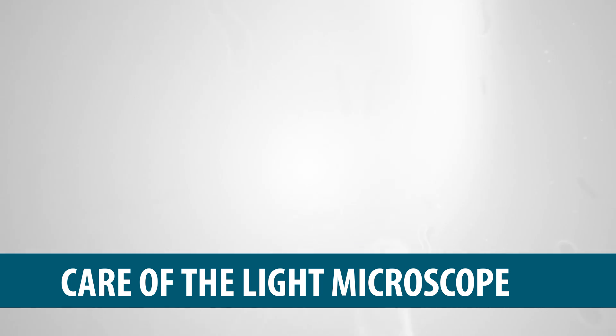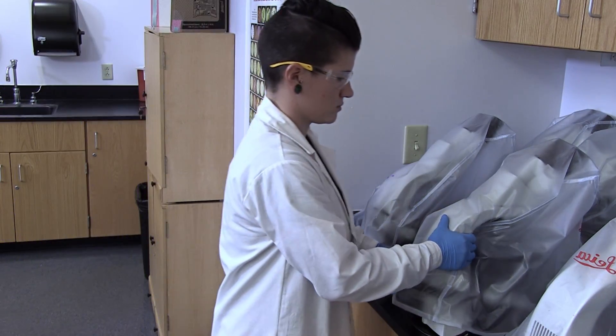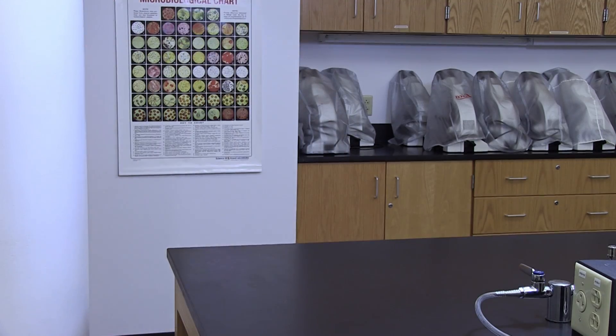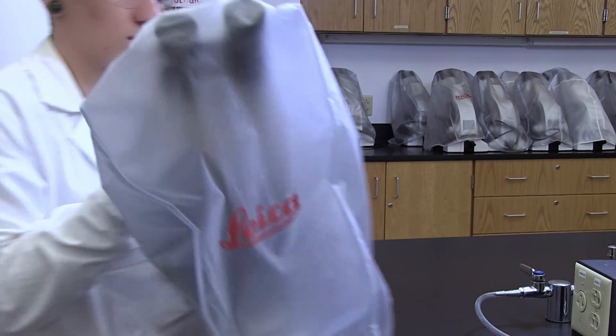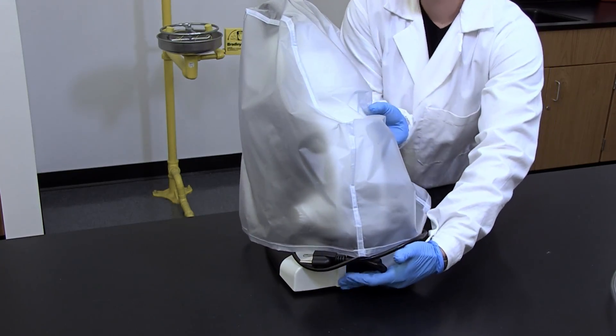Care of the Light Microscope. The microscope should always be held with two hands when transporting it. One hand should grasp the microscope around the arm, while the second supports the instrument from the bottom. Once at your bench, place the instrument gently on the table.